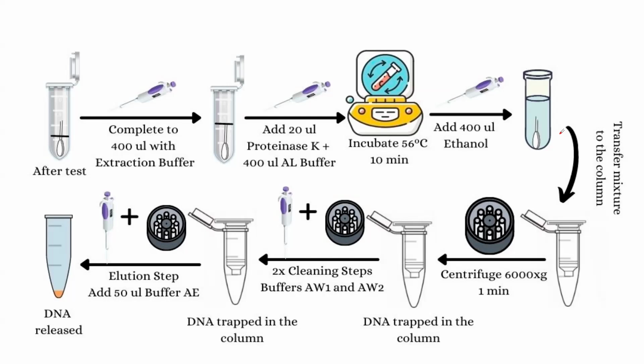So when you get your DNA isolation kit, there are protocols that tell you to follow this step, do this, do this. If you do that, at the end you are going to successfully have your DNA.